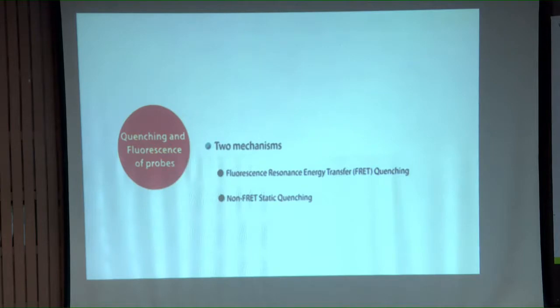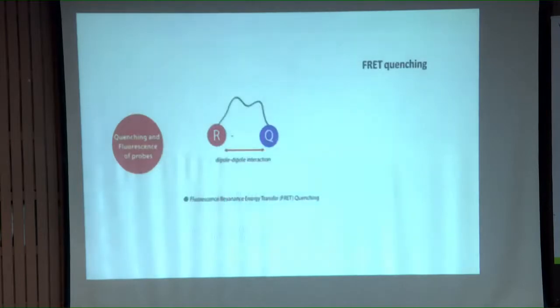One thing is sure, as long as the fluorescence probe and the quencher are together, separated by few nucleotides, the fluorescence is under the quenching activity of the quencher. That means there is no fluorescence at all, right? And the mechanism of quenching the fluorescence is two mechanisms. One is FRET, another one is non-FRET, right? FRET stands for fluorescence resonance energy transfer, right? So this is FRET quenching.